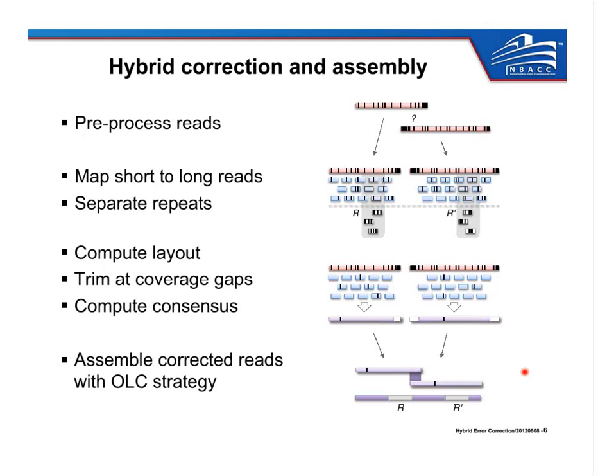You can use it for RNA-Seq programs. And this is the key to our method, in that the PacBio sequencing technology itself has been heavily limited by a lack of tools available to analyze the data. What we've done is create a pre-filter step that essentially takes the high error PacBio data and turns it into high accuracy data that can then be used and analyzed with any of the many bioinformatics tools that were developed over the past 10 years.